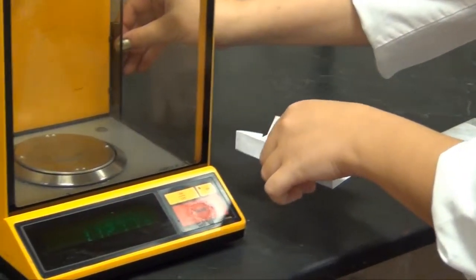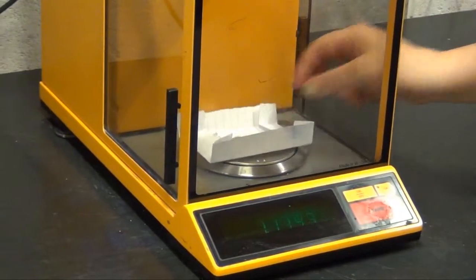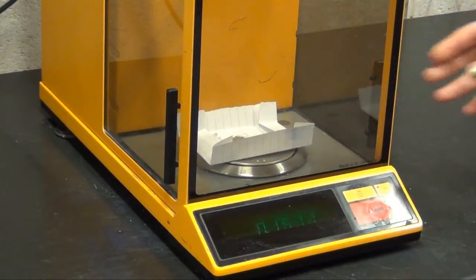The sample is placed back onto the scale and this time the only thing that is being weighed and measured is the sample that is being placed on the balance in the boat. The boat is not counted in the calculation.